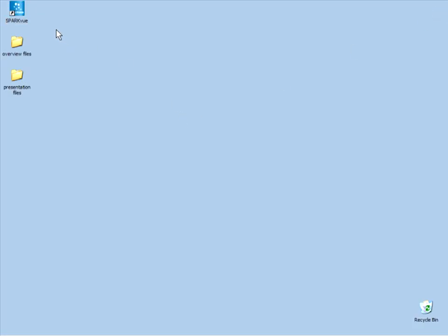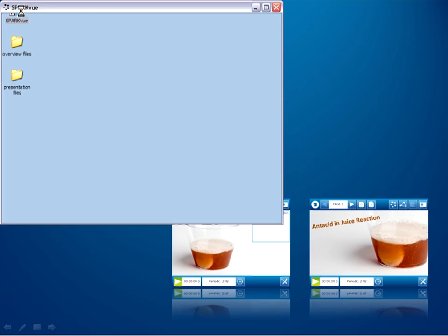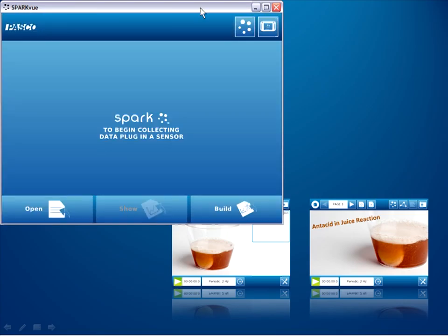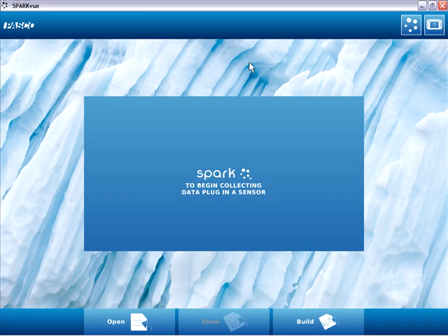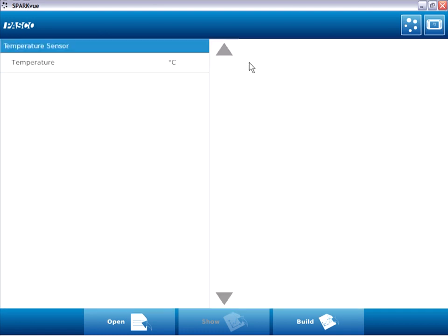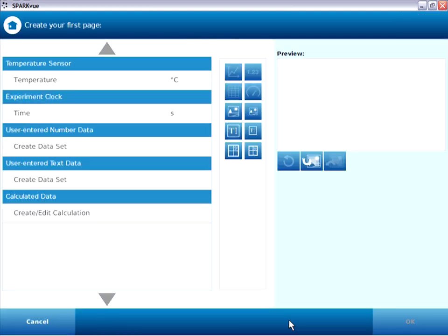I'll begin by launching the SparkView software and connecting the sensor I'll be using for this experiment, in this case, a temperature probe. Now, whenever we build our own original experiments in SparkView, we choose from the home screen the Build button, and this brings us to the Build page. We'll be using this Build page to construct each page of the Spark Lab, so let's take a close look at its elements.